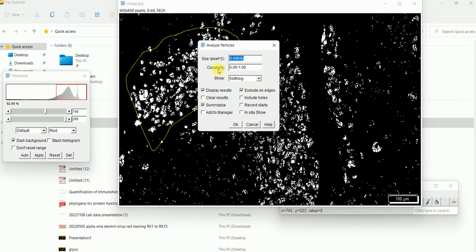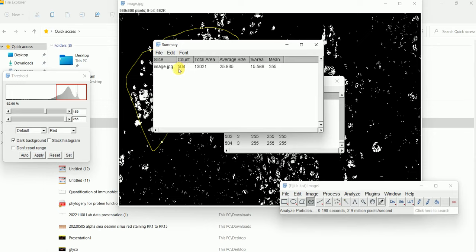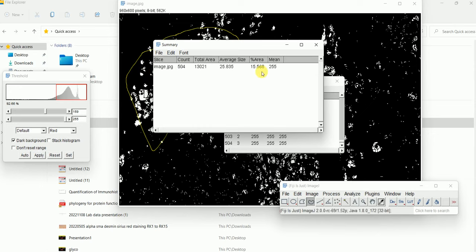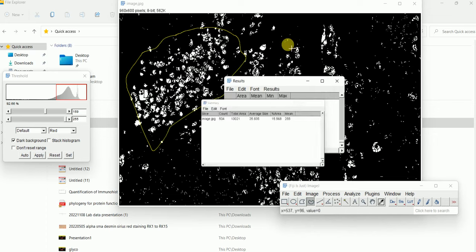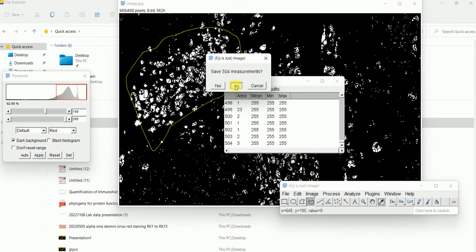In the Analyze Particles dialog, you can also specify circularity parameters — for example 0.1 to 1 — it's totally up to your experiment. I'll keep it as is and press OK. Now you can see that the total number of positive cells in this selected area is 504. The percentage area has increased because it has only considered this selected area as the total area. It's pretty simple — I hope this video was helpful, thank you very much for your attention.